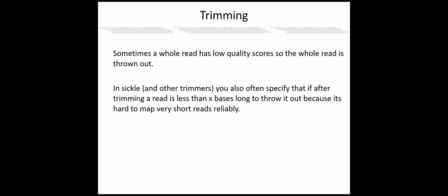Has anybody ever tried to align sequences that are less than, say, 25 or 30 bases long? Anybody out there in class ever tried that? All right, I'm not seeing much response, so I'm guessing not a lot of people have tried that. That's a good thing. Trying to align very short sequence to the human genome is typically a waste of time. They'll align to a lot of different places. They're not very confident, and it's just generally a bad idea.